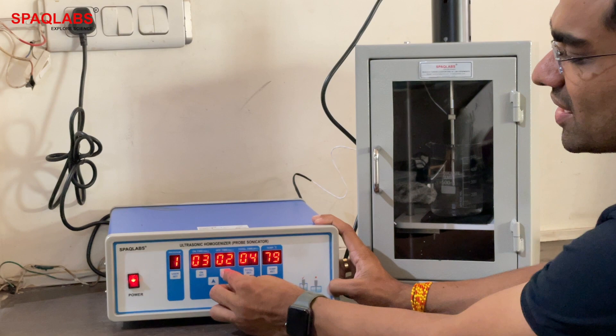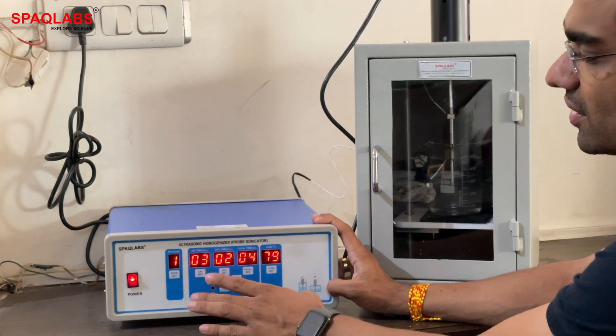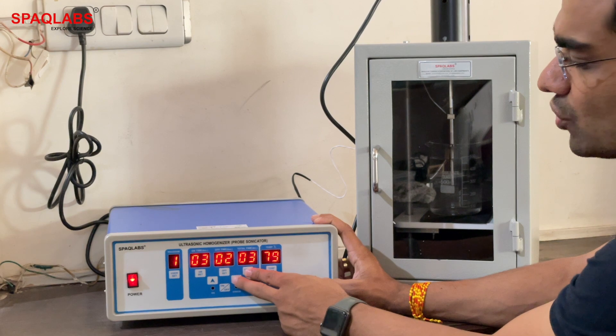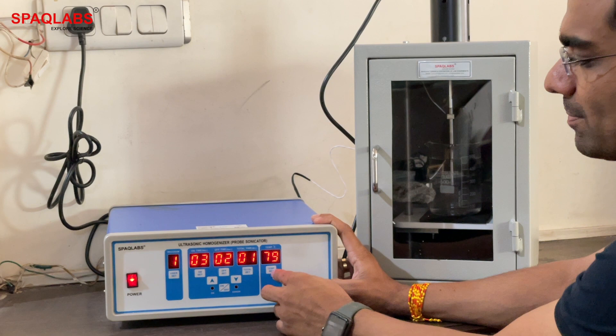Press down to make the value smaller. Now we have two seconds off and three seconds on. For total time, click down and press — this will reduce it to one minute.